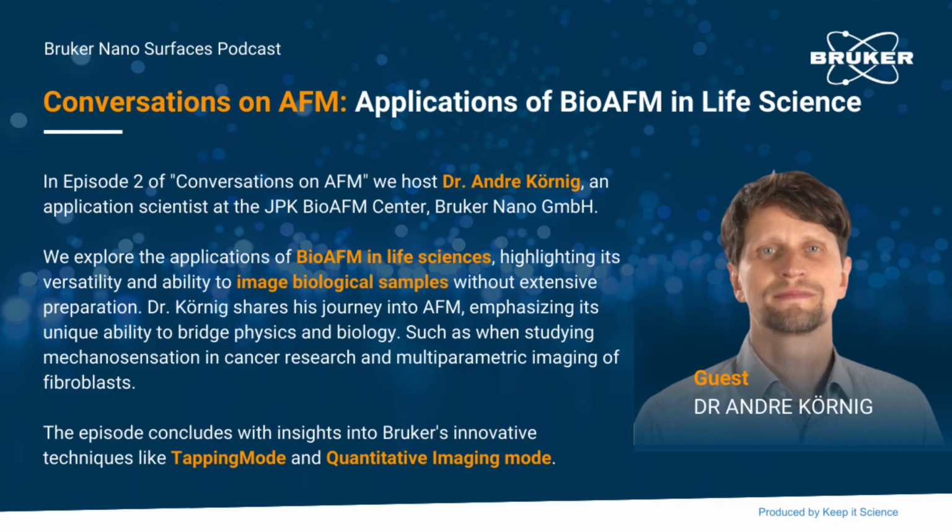It has the advantage that the cantilever always comes from the top, which makes it easy for samples that are not so well fixed. For example, in the beginning I mentioned the magnetotactic bacteria that I couldn't image at all. Maybe with this QI mode it would now be more possible, because it's more gentle to your sample and doesn't push things around so much. And it also gives you quantitative information out of your sample.